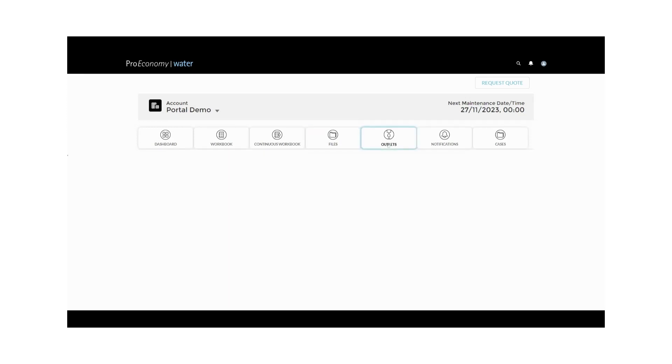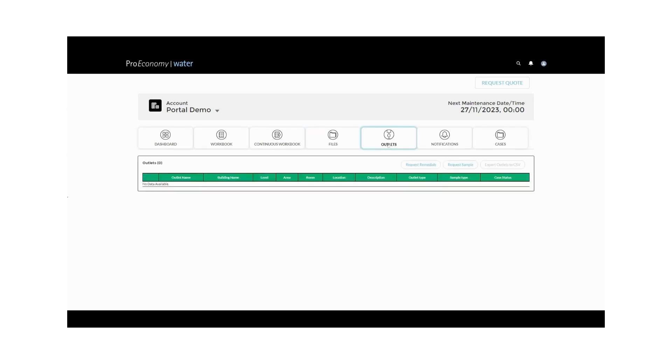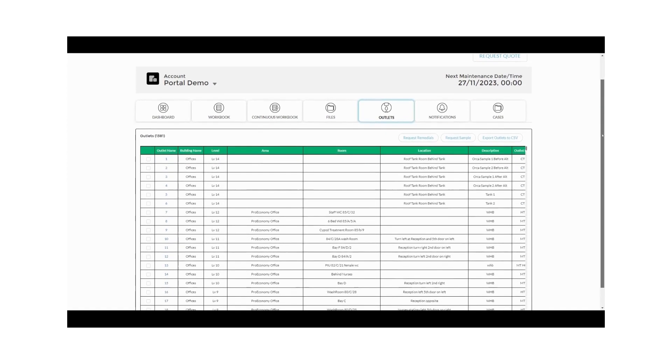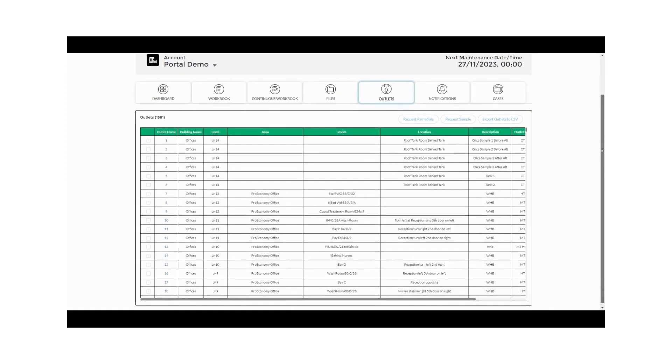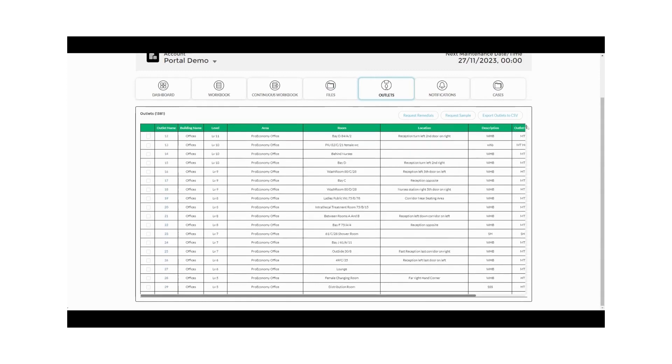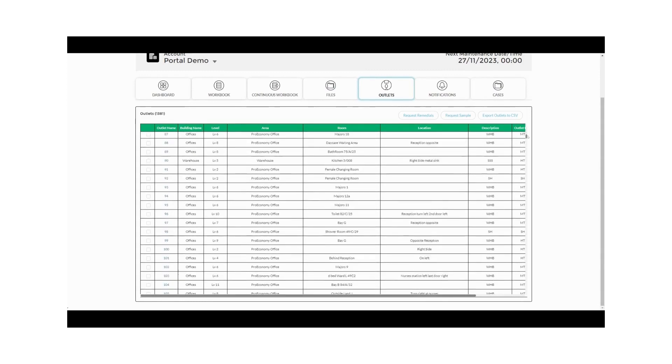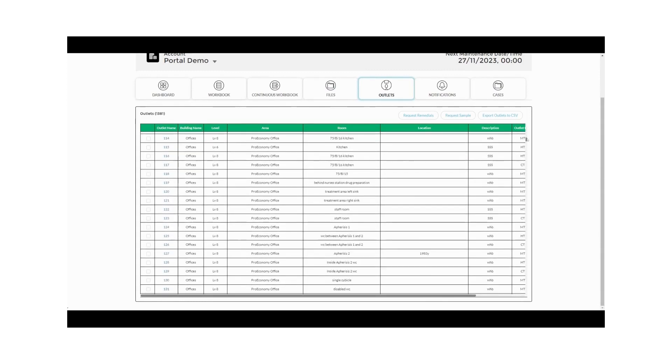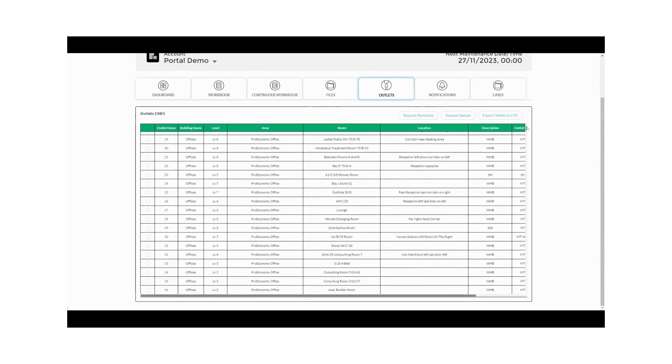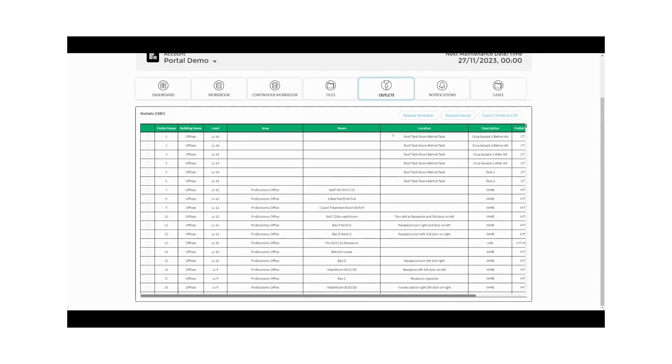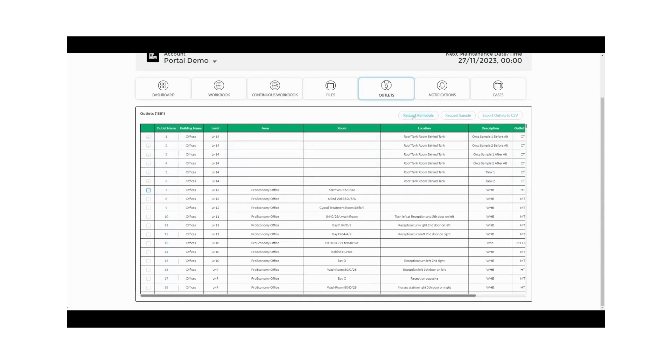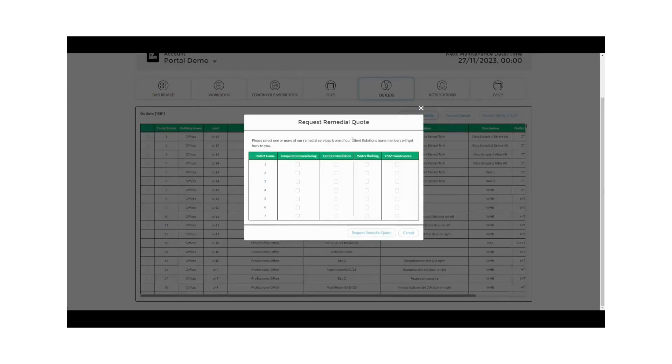The outlet tab is a comprehensive database of all the outlets we've ever sampled on your site. With this information at your fingertips, you can efficiently request remedial actions and re-samples needed to maintain water quality. Use this data to request remedial action or ad hoc samples for specific outlets.